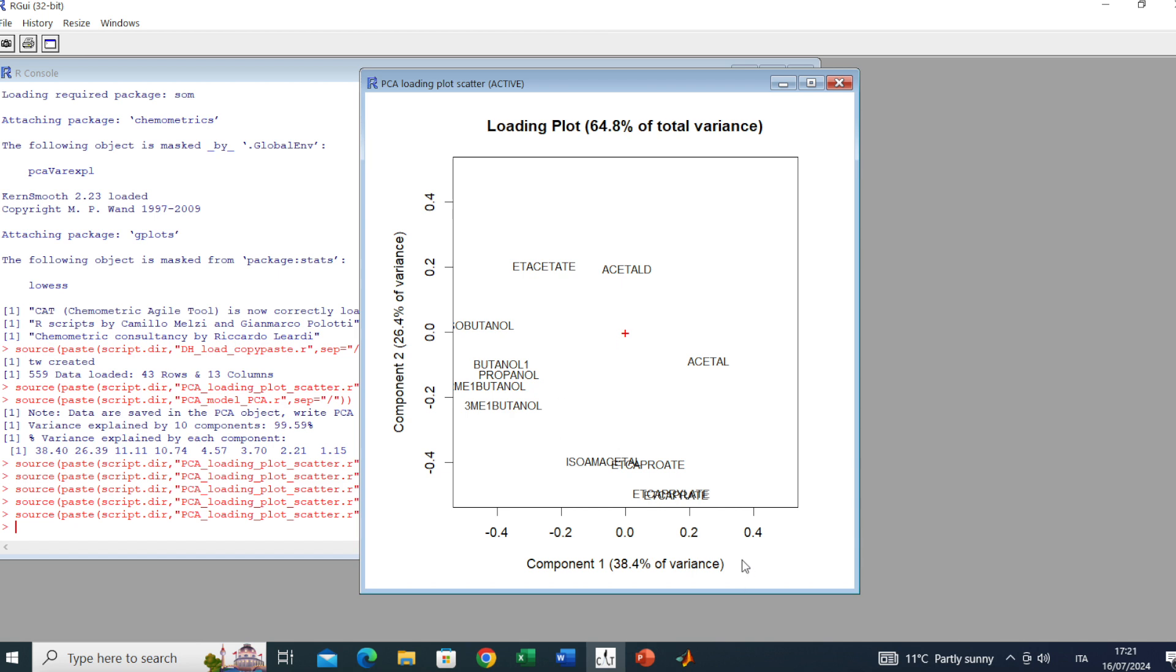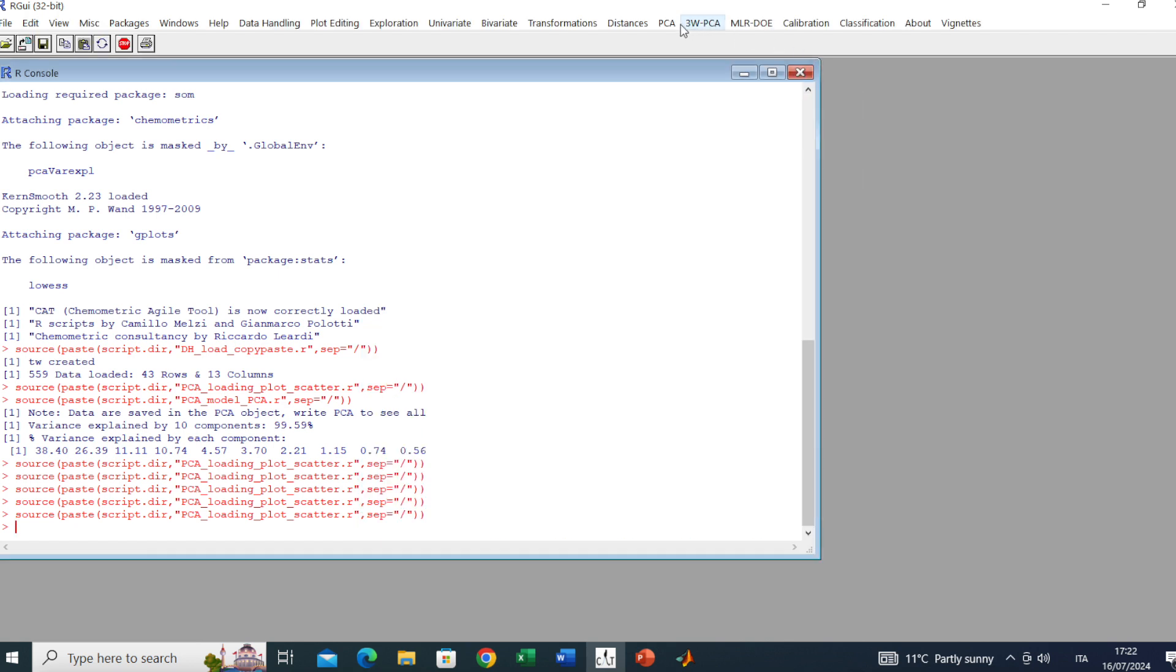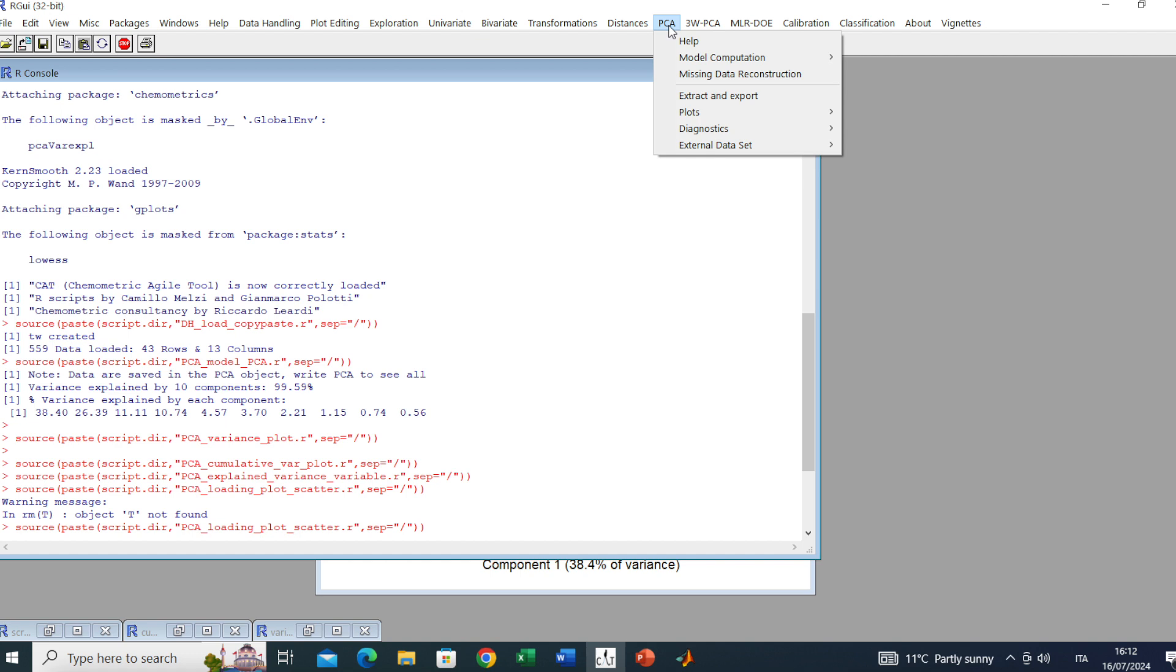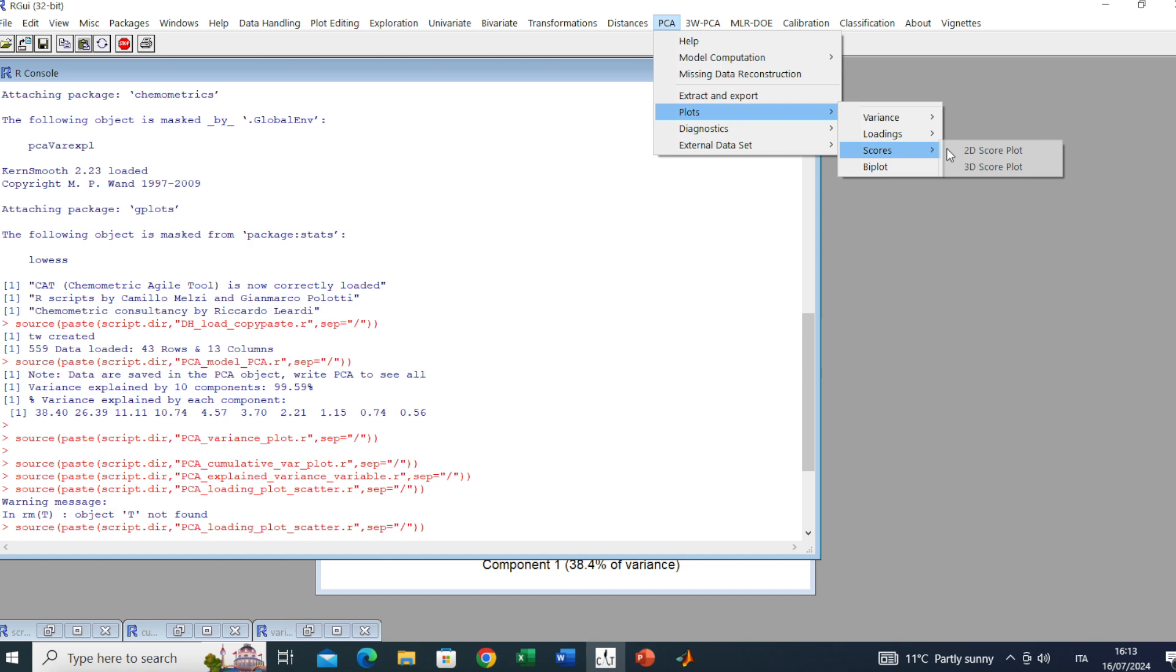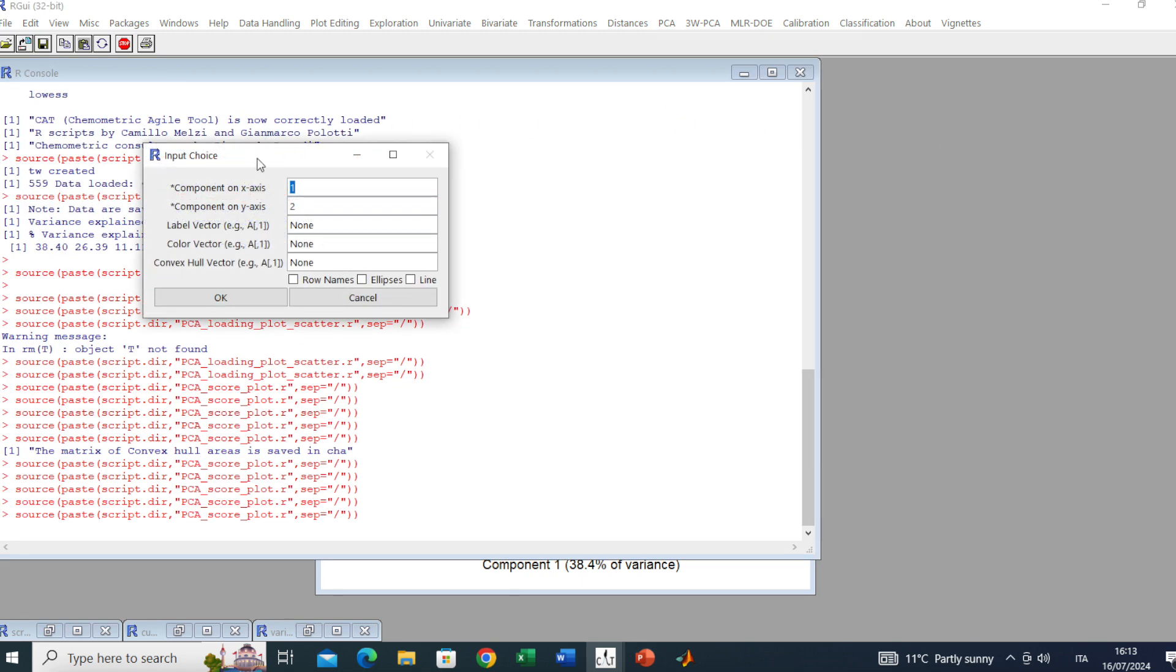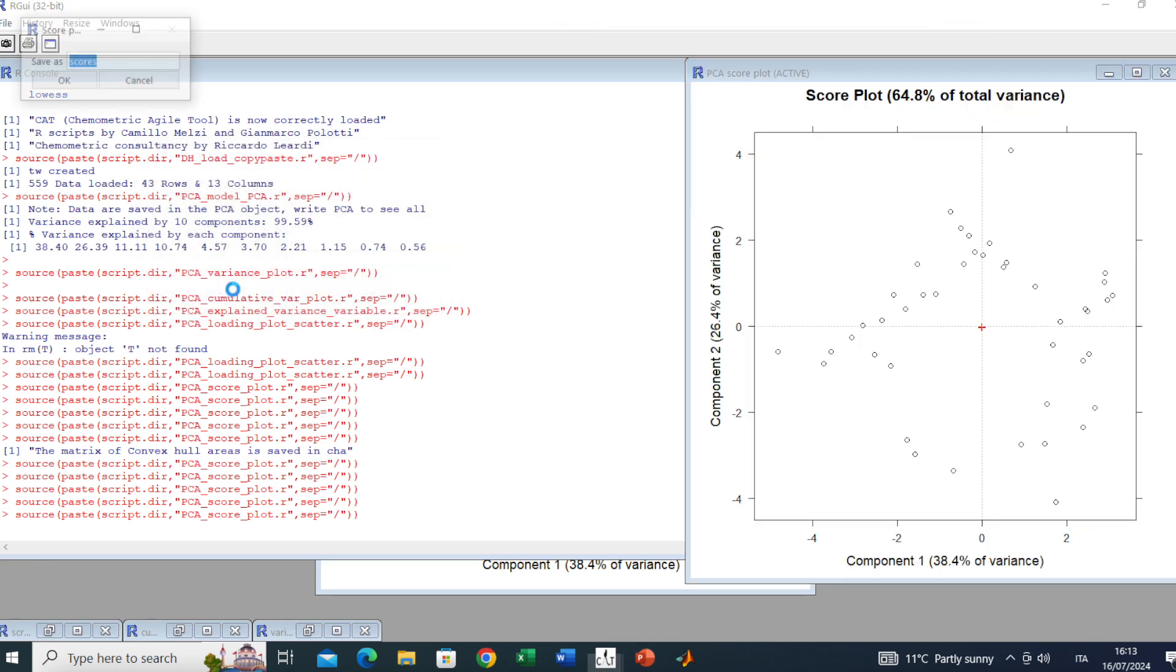At this point, let's carry on with the score plot, important to look at the samples displayed into the component space. We go to Plot Scores, Two Dimension Score Plot. Here we have the two components on X and Y axis. If we don't add any additional information we will get this plot over here.